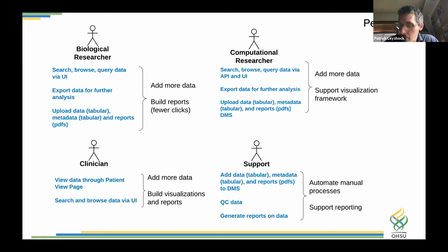One is manual data entry, as we touched on earlier. Second is actually performing QC of the data. So once data is in the system, we need to make sure that it is correct. And Sarai's team is trained to do this. We use LabKey server's out of the box QC workflow to do that. And finally, generating reports and data. This is something that the data team is increasingly doing. This involves everything from writing Tableau reports, as we talked about a few minutes ago, as well as simply using user-defined queries in LabKey server and surfacing those as query reports within the study containers.